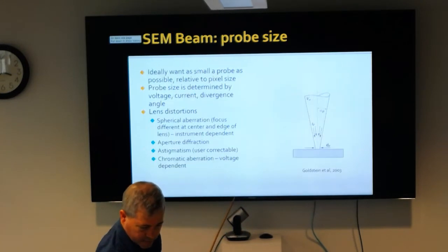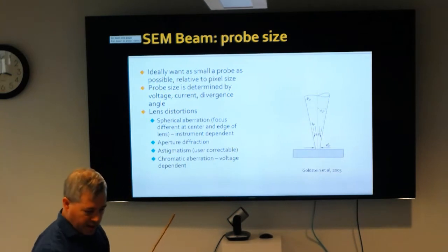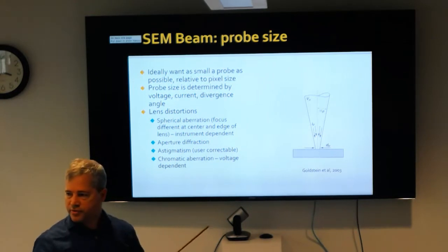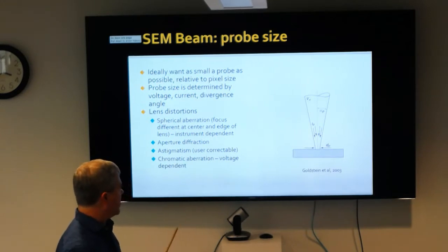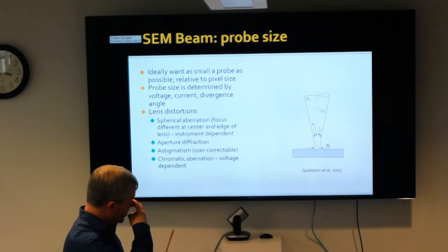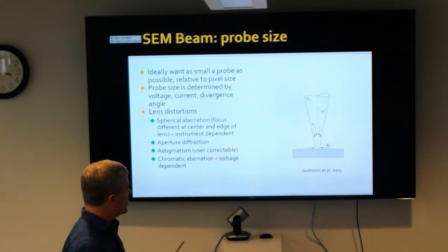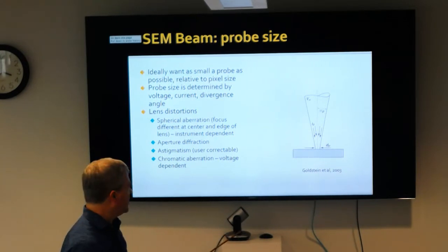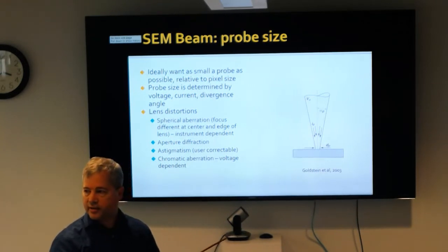What's a standard probe size? Microns, millimeters? Smaller than microns, so nanometers. Okay. Or tens to hundreds of nanometers probe size. The resolution you get on this is not angstrom resolution. The best resolution, at least that we get on ours, is around 3 nanometers. Okay, so 30 angstroms. Yeah. I suppose there are newer instruments that will give better, but 3 nanometers is about the best we can get on ours.